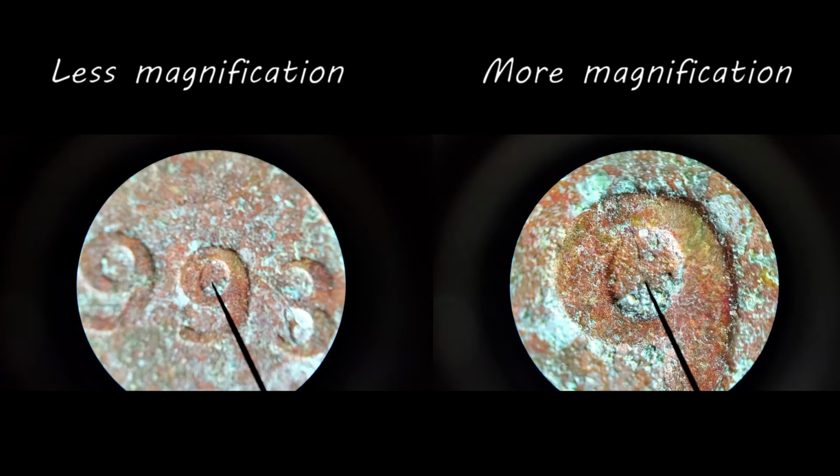The first thing we're going to talk about today is magnification. Magnification is the apparent increase in size of an object when looking through a microscope or a telescope. When we look through a microscope, the objects that you observe will appear much larger than they are without the microscope. And we can quantify how much bigger something will appear by describing the magnification of the image.